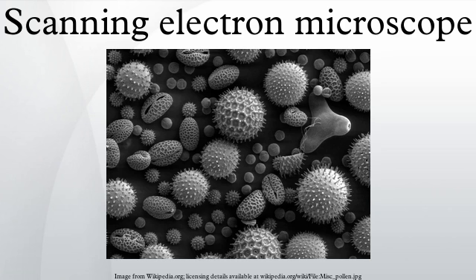Freeze fracturing, freeze etch or freeze and break is a preparation method particularly useful for examining lipid membranes and their incorporated proteins in face-on view. The preparation method reveals the proteins embedded in the lipid bilayer.